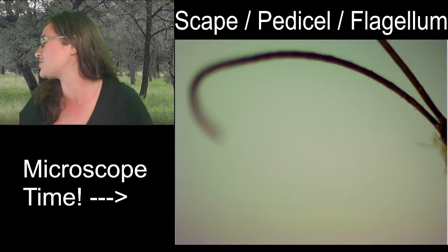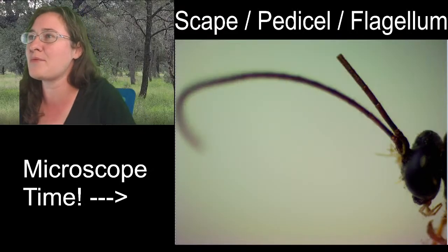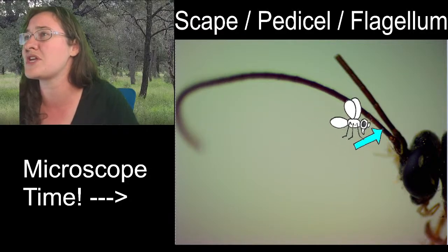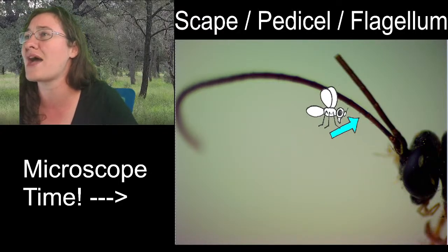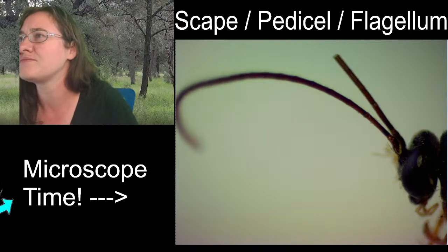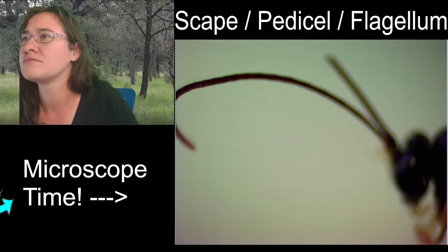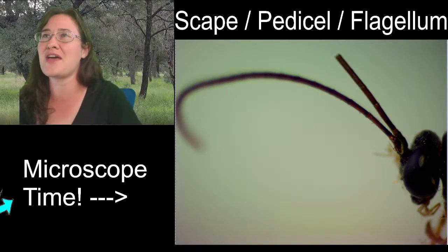All right, so I was trying to get an idea of the length of some of these antennal segments. And what I'm coming up with is that the third antennal segment, or the first segment of the flagellum, is the longest. It goes from here to about here. That's probably two or three times the length of the scape and the pedicel combined. But then all of the remaining segments get smaller and smaller. There are a lot of segments. I was trying to count them, but I got to something like 35 and then miscounted.